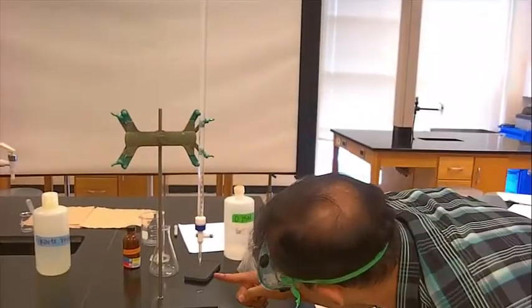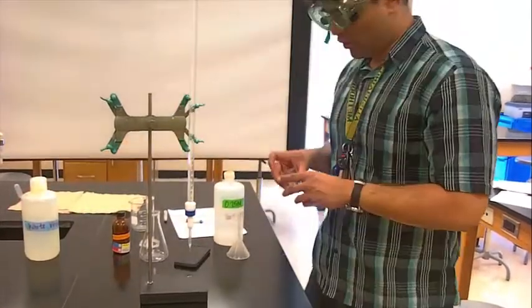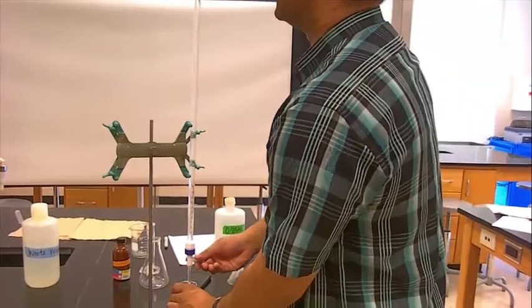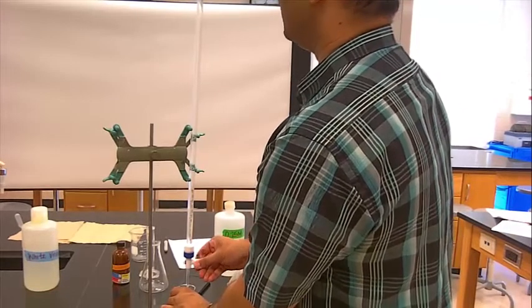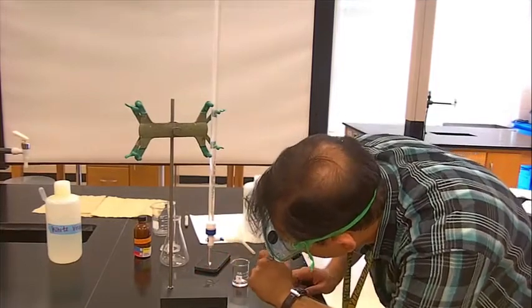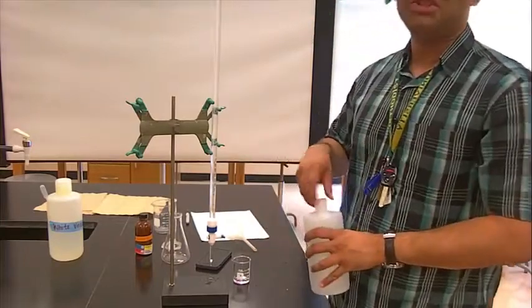I went above 0, and I'm going to look here to see if there's any bubbles. There are no bubbles. Everything looks clear. So I'll just lower this down to about 0 mils. You can always adjust this accordingly. And this is a little bit over 0 mils, so I'm just going to get this down to 0.00. So slowly turn that spigot. Take a look at the bottom. You will see that there are no air bubbles or air pockets. I'm at 0.00. My titrant, which contains 0.25 molar NaOH, is ready to go.